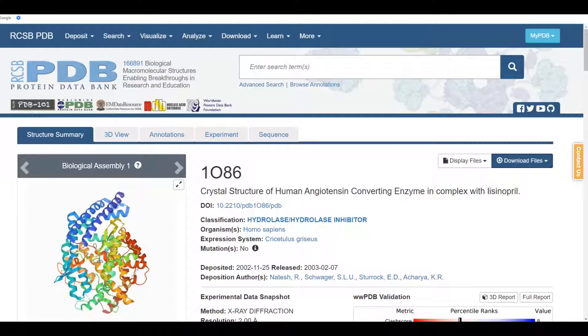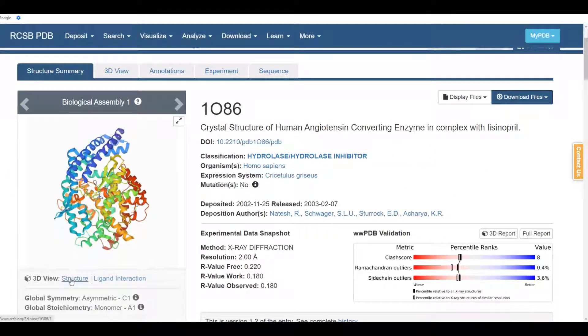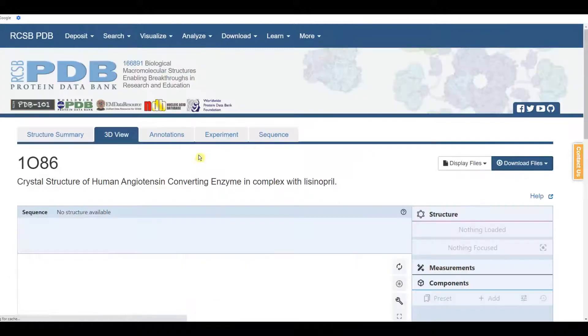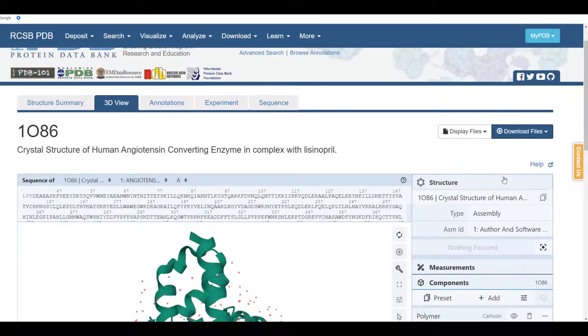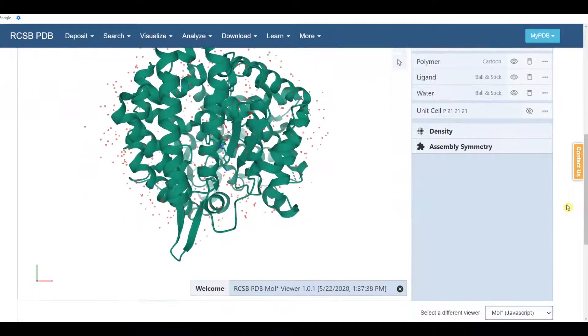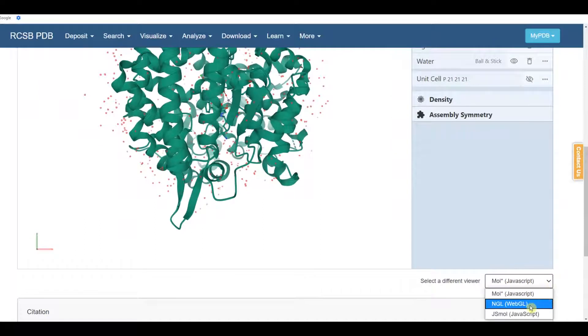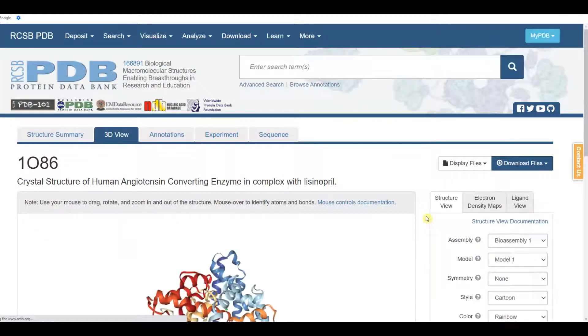This protein is an important target in the biological pathways that regulate blood pressure. Let's click on the structure link and bring up the structure. I'm going to change our viewer to NGL. It's in the bottom right corner.